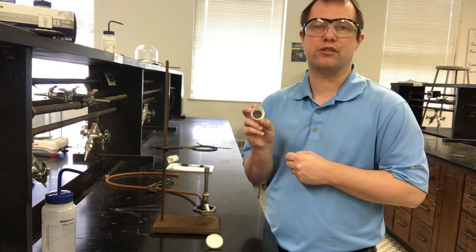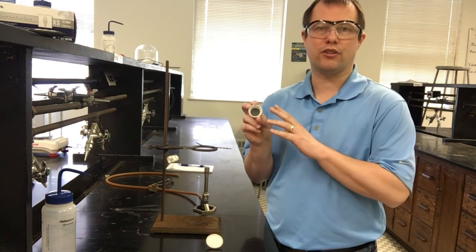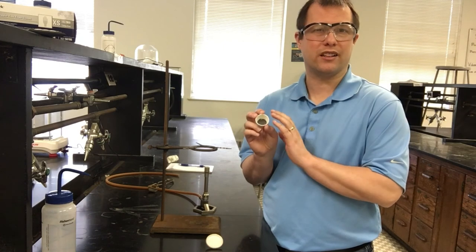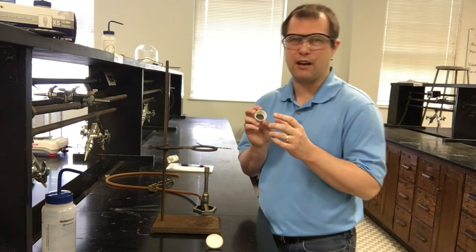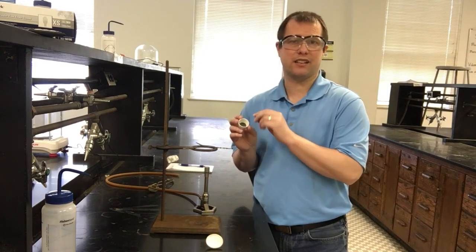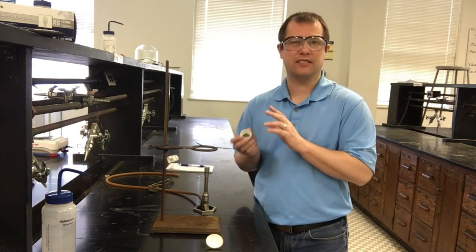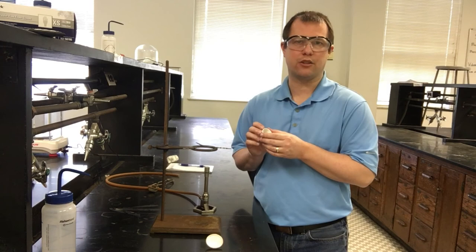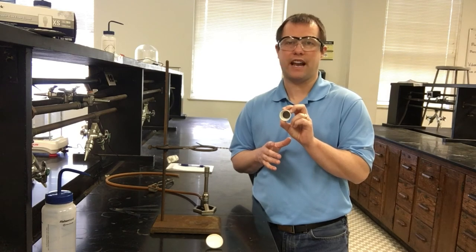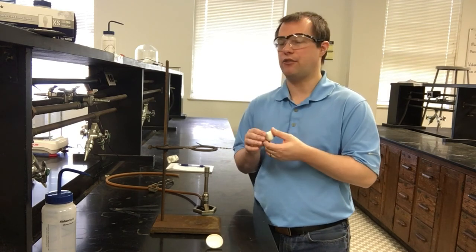The very first thing you'll do is mass out your crucible. You'll notice it might look a little dirty — I've already gone ahead and cleaned it. You don't usually clean these crucibles with water; just use a paper towel and wipe them out instead. Water and magnesium, if there's any leftover magnesium, react pretty violently, so that's what we're trying to avoid by not using water.